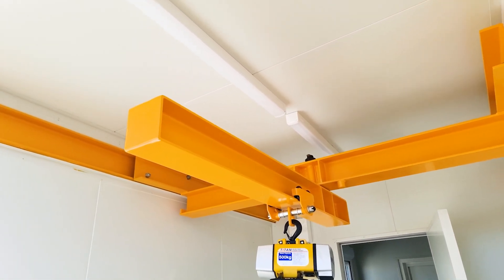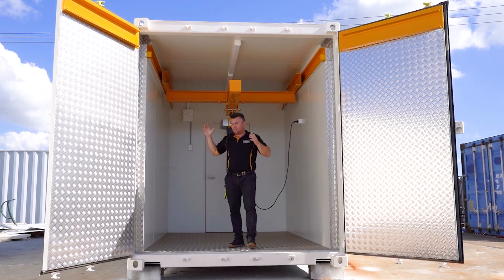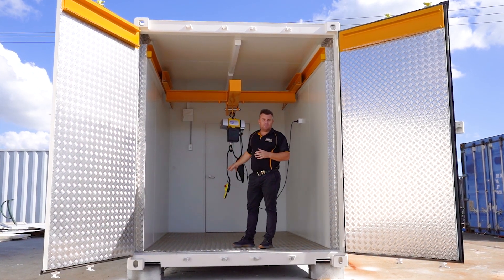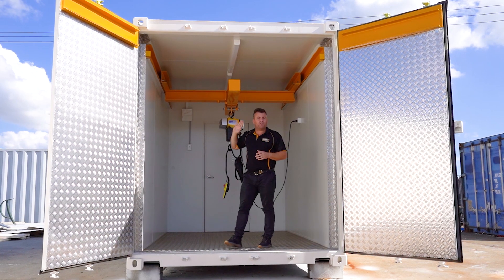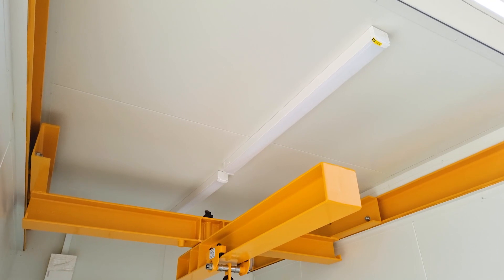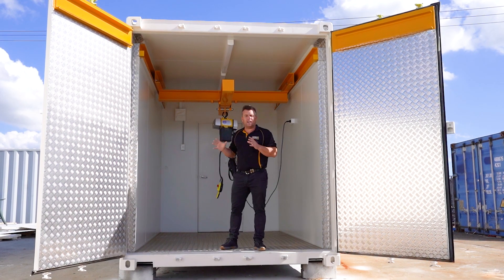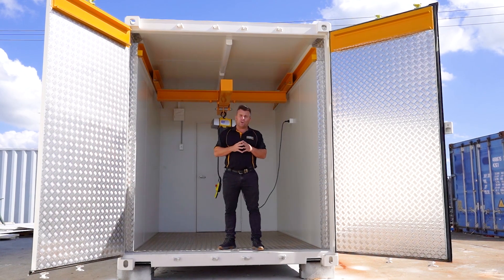This crane system will protrude out past the doors and then come back in to be analyzed in here. You can see we've fully insulated the container with a couple of power options and a huge LED baton light, ensuring there are zero shadows overhead and allowing us to work night and day.